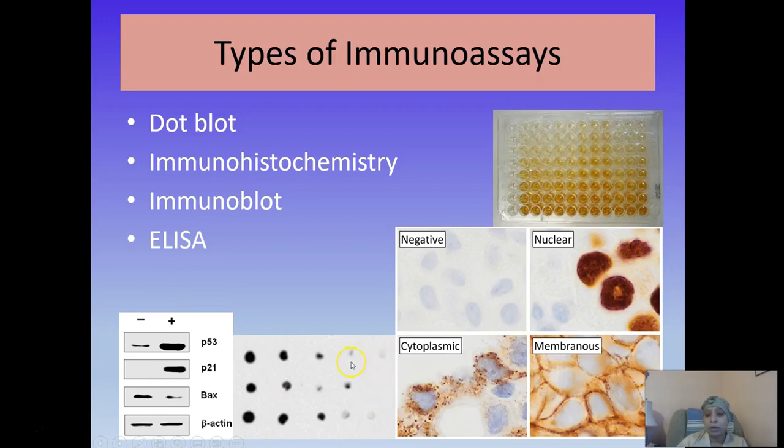If you have a low, faint signal, that means it's at a lower concentration than if you have a higher, darker band or signal. So this is semi-quantitative at best, unless you utilize a follow-up method, usually computer programming, to examine the relative amount or to quantify the exact amount using a standard control.